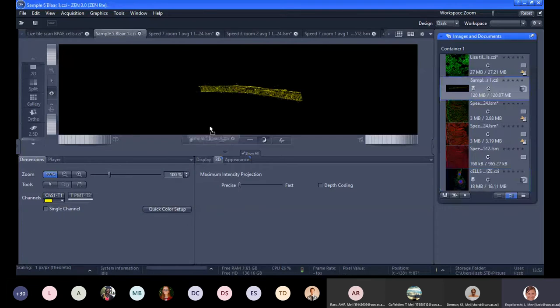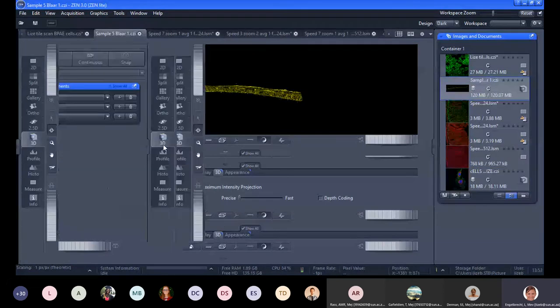This is from a stem that we've used. We've imaged in Z-stack, and you can then represent it. Oh, sorry, guys. The rendering is really problematic on my laptop. Again, maybe it would be great to have you in our lab and show you all of these things on a big screen, fast computers, not on my laptop.